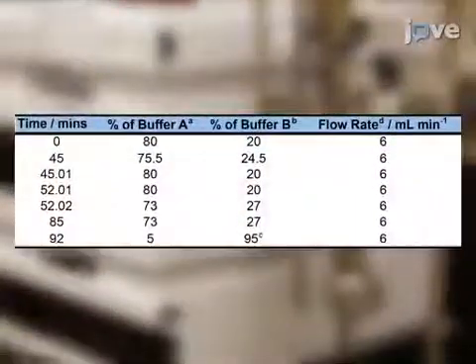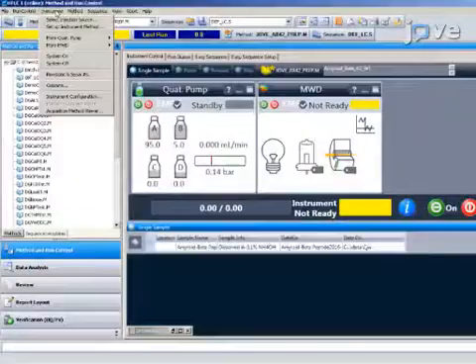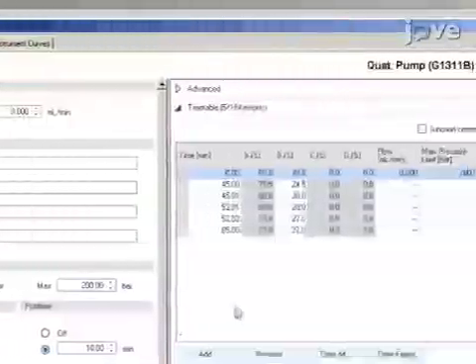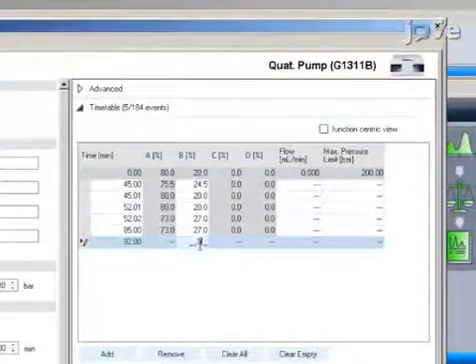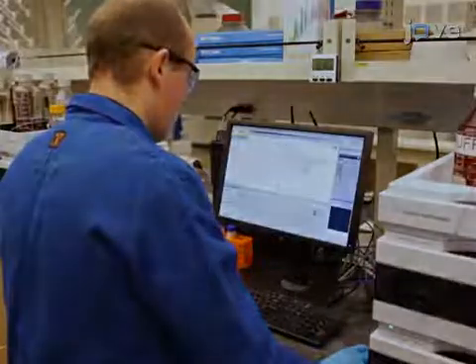Now program the HPLC software to run the purification method. From the setup instrument method option, enter the purification method by changing the solvent timetable parameter. Lastly, turn on the HPLC pump from the HPLC software.